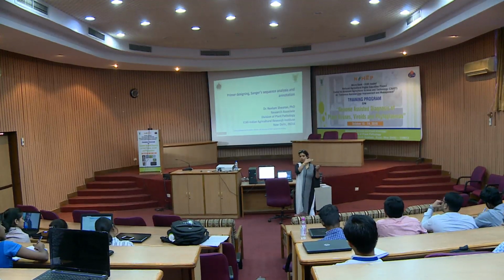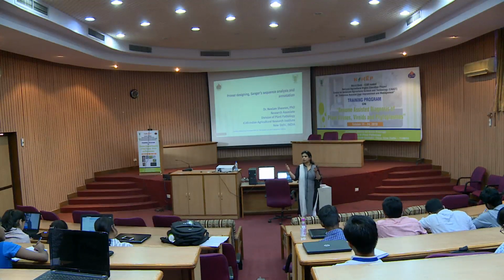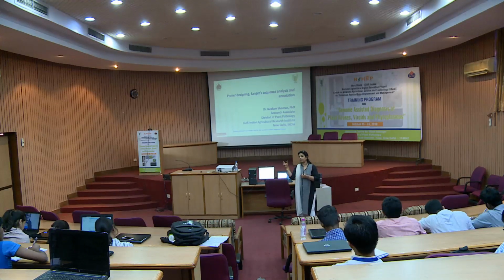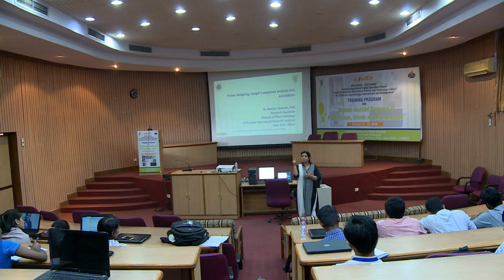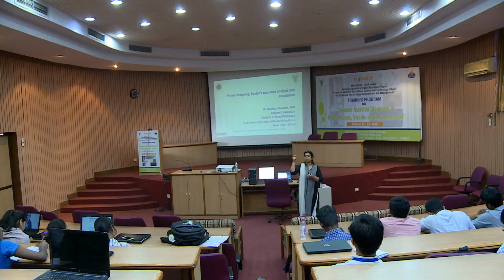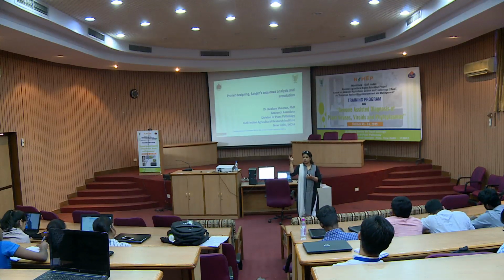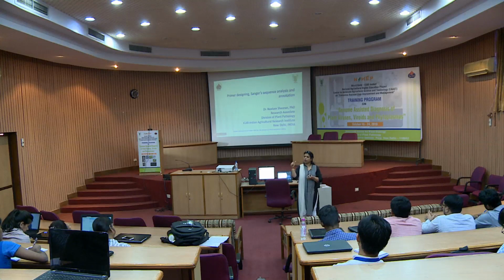Then the primer positioning should always be from the 5 prime to the 3 prime end, right? The designing should be 5 prime to 3 prime. Towards the 3 prime end, you ensure that there is some GC available over there. Why do we need that? Because AT bonding is 2 and GC is 3, so that will ensure that your primer is binding tightly on your template, right? So, that also you can take care of.